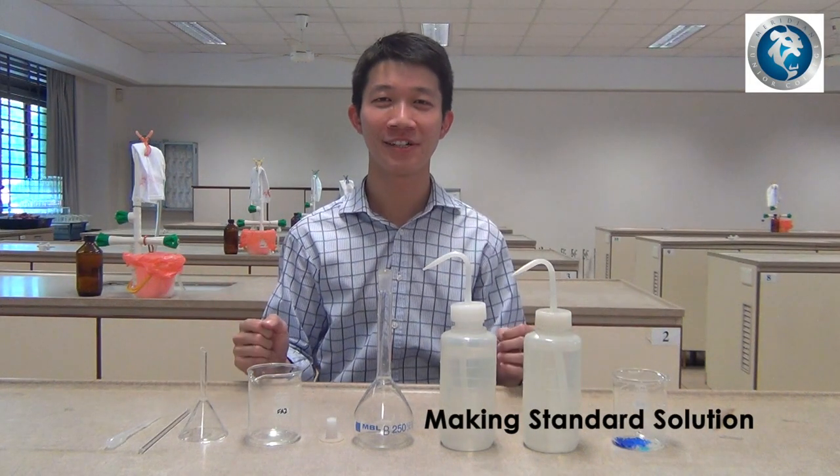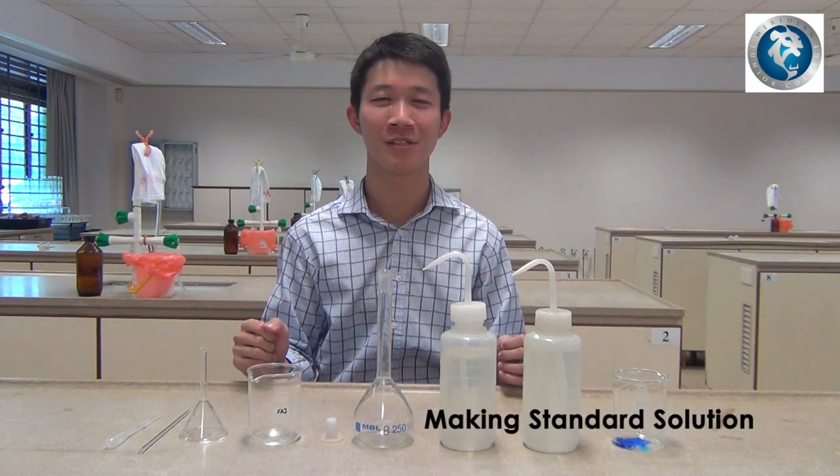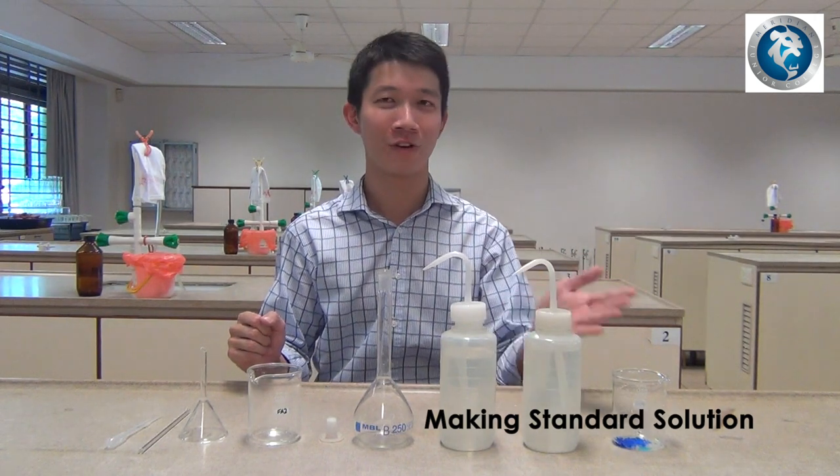In this lesson, you'll be learning how to make a 250 cubic centimeter standard solution from a solid sample.